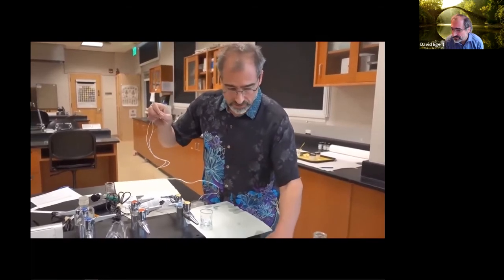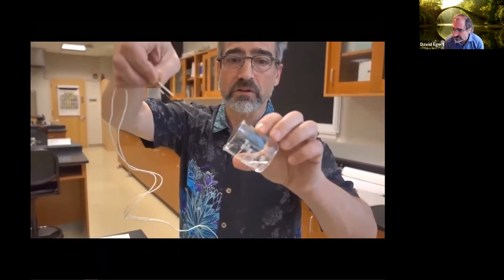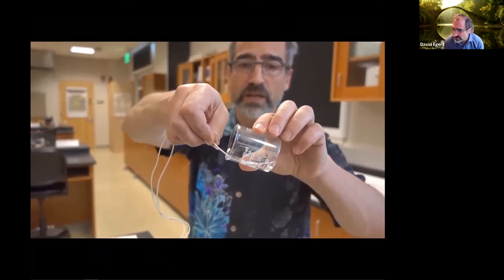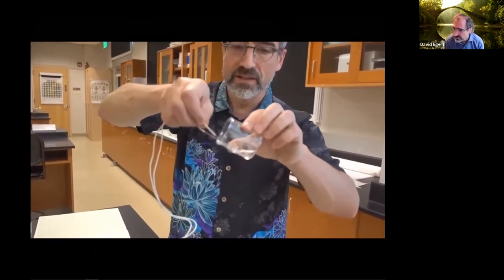Now I'm going to go into my sodium chloride. And again, the same thing. Air, there's no electrical current. I'm going to submerge them in the sodium chloride. I don't know if you can hear that. You can hear the little buzz go.